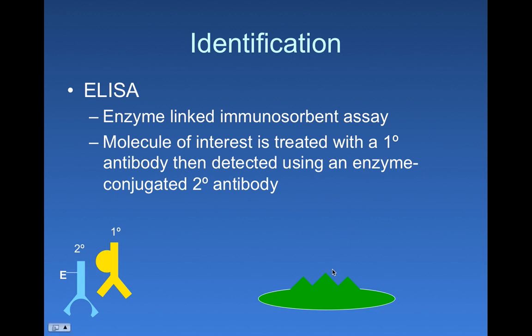This will act as an antigen, and there'll be an immune reaction against it. A very common animal to do this with are rabbits or mice or sometimes even goats. Rabbits are the most common. So we'll take our Ebola protein and inject it into a rabbit. The rabbit will have an immune response against it, and generate antibodies against it.